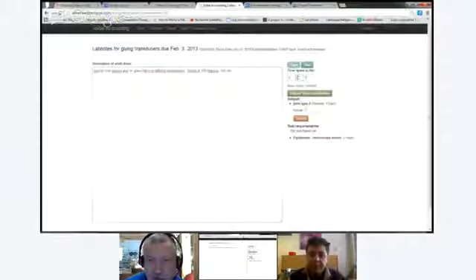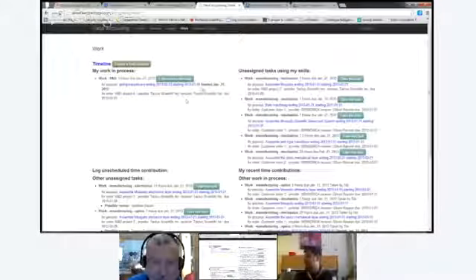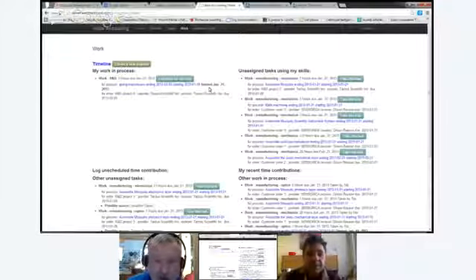You want to put some time in there. Okay, now you can submit your time contribution. Now it says started. If you go back and click on lab notes again, you can continue to work on that.